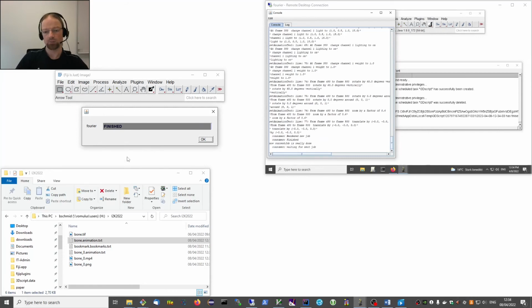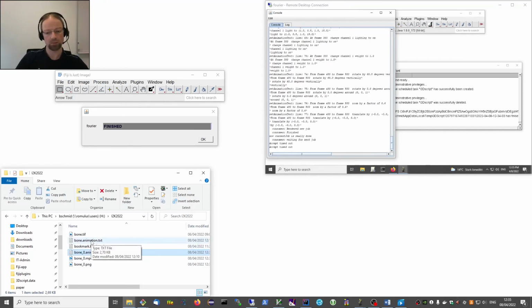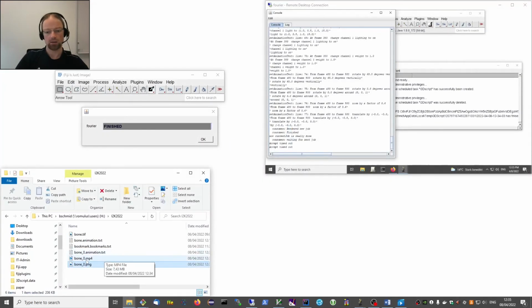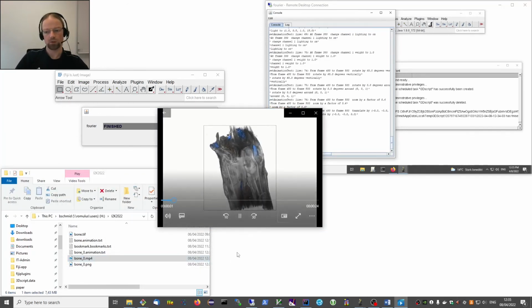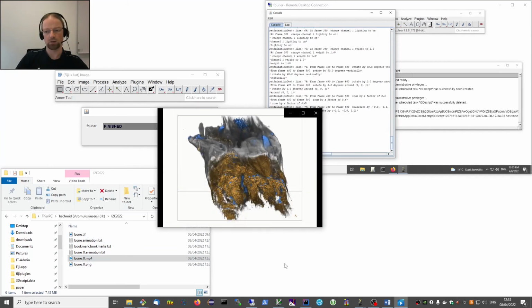and then maybe you remember I did not click download because by default the result of the rendering will just be put in that shared folder. And you see we have now here 3 more files in that shared folder. One's the animation file. We would have needed it in that case because we have it here already, but still. There's a PNG, which would just be a still image. And there's an MP4, which contains the animation which we just rendered on the server.